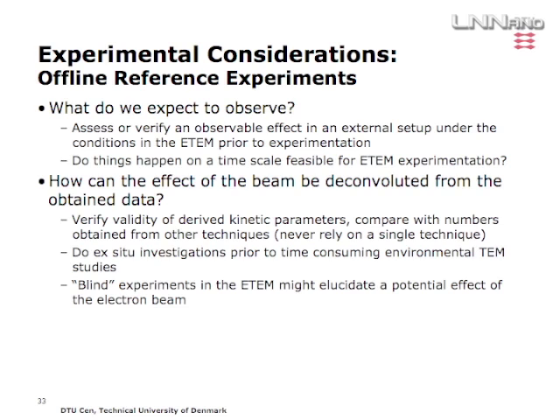And also, that's a time issue. Many experiments or many phenomena happen on scales that are not suited for TEM. So usually you can sit in the lab for maybe a day straight, but experiments taking much longer than that are not really feasible unless you have a partner that you can switch with.